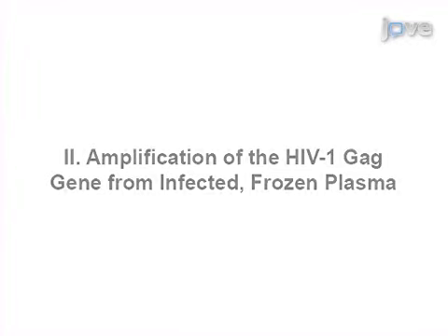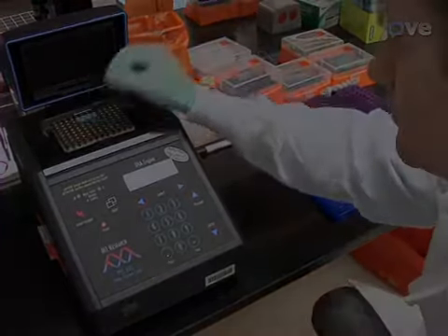To begin this procedure, reverse transcribe.